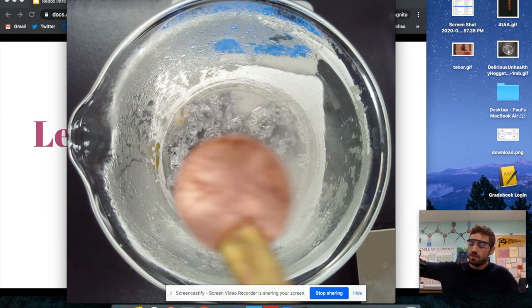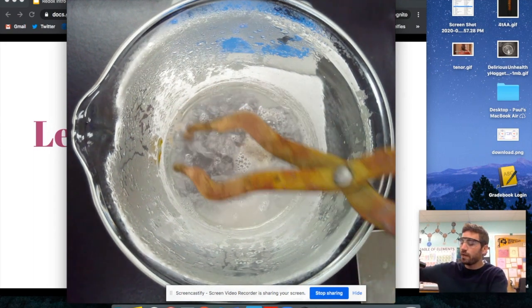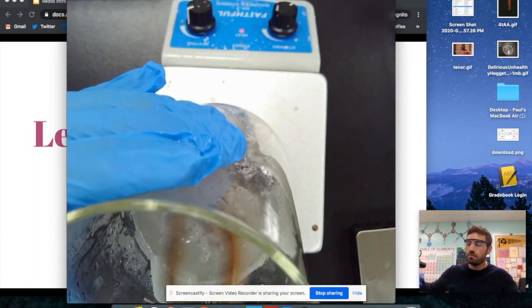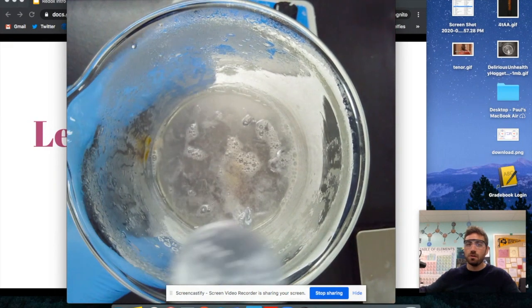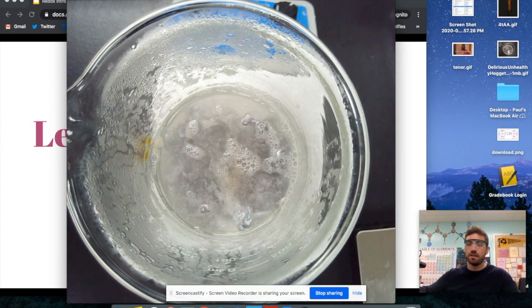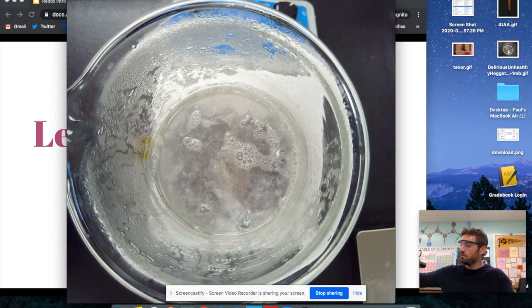I've had a couple already sitting in here, so we can pull one out, but it takes about 2 to 5 minutes. And there's a chemical reaction that happens. So let's pull one out. And we can see that we have ourselves still a penny. But does that look like a penny anymore? Not really. All right, I'll show a picture of it in a second, but we got ourselves a nice silver penny. And let's cool it off and clean it off in some water.